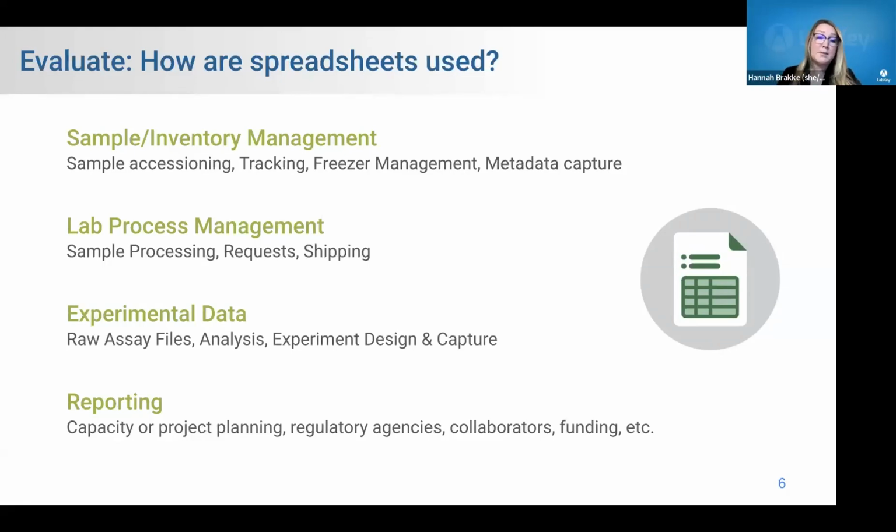The experimental data component, of course, raw data files from instruments, right? So this is something we may not have a lot of control over in the end, but certainly we're getting that experimental data through instrument files. Using Excel for analyses or aggregation of data is very, very common. And then sometimes we see Excel or spreadsheets being used for experimental design or data capture around experiments too.